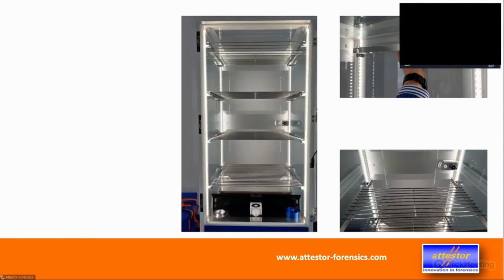It makes a very hard surface, and the electropolishing moves the chromium that's inside stainless steel to the surface, creating a very blank, very shiny, and very smooth surface. Right, so you can easily remove them.